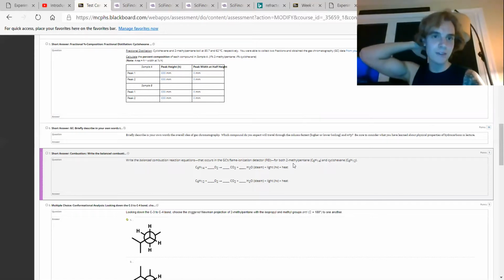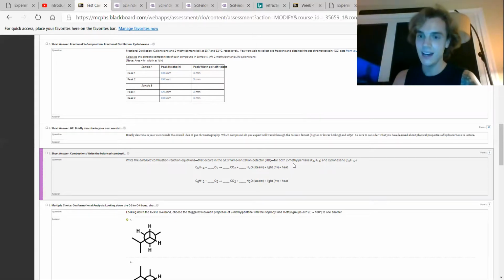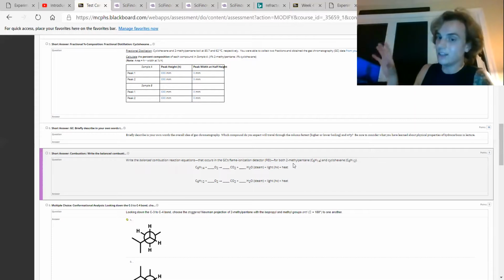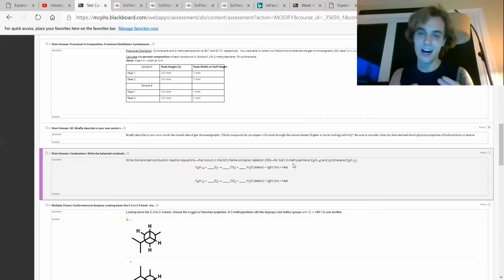I would expect most of you to guess on your first response. And I would expect the majority of those of you that guessed to get it right. It's a pretty easy response, pretty easy guess, and pretty easy intuition as to what energy state a molecule might enter going along the gas chromatography, knowing that the temperature is increasing as it goes through the gas chromatography. So I give you guys a lot of answers, very straightforward through these videos, but that one I will leave up to you.